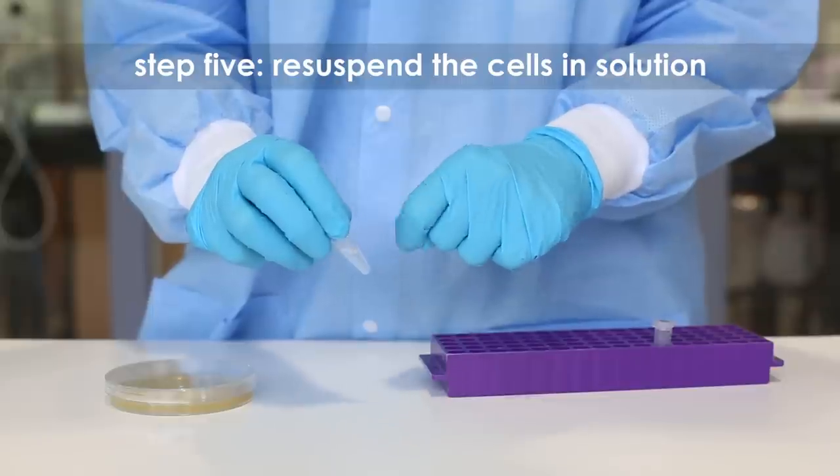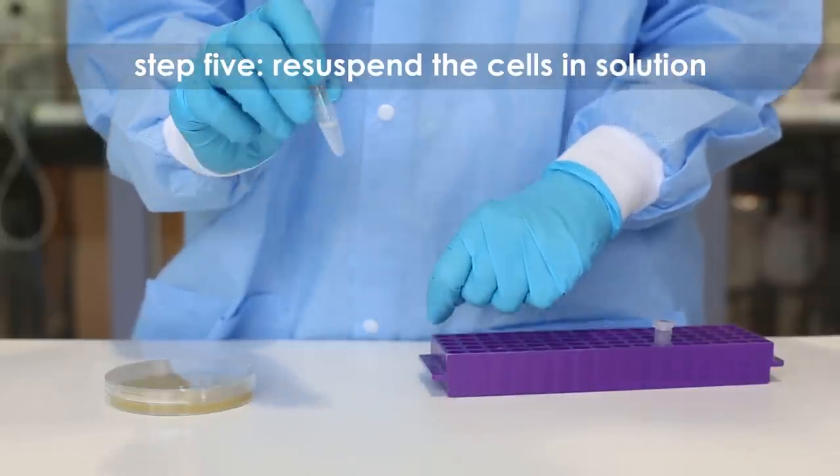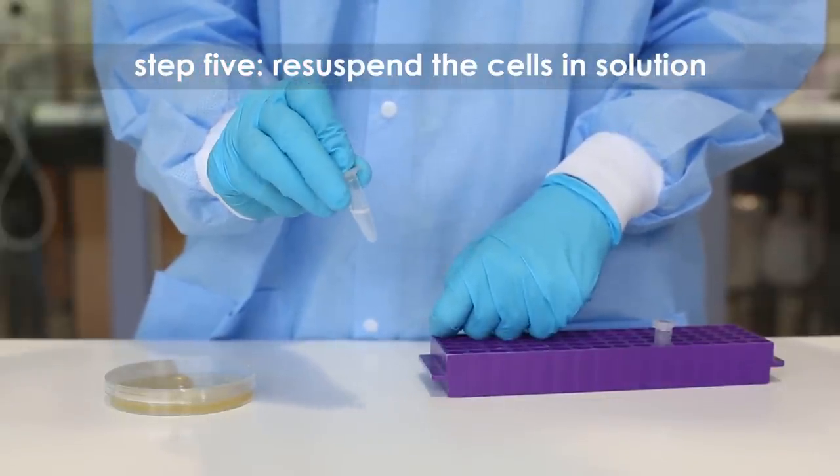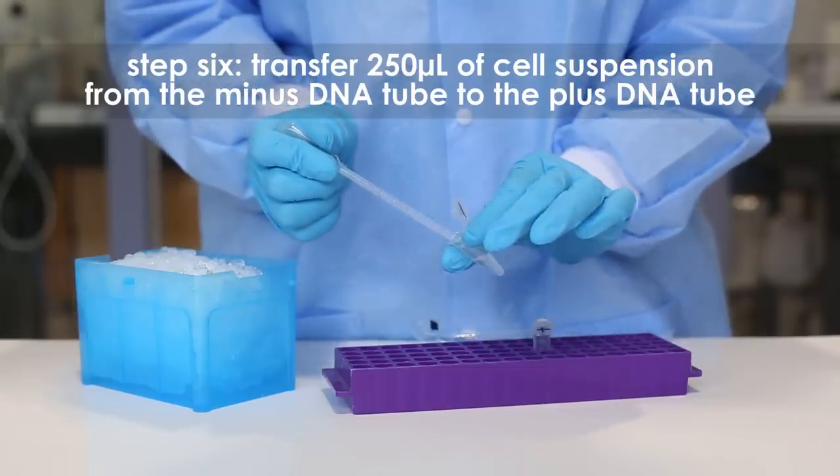Step five: fully resuspend the bacterial cells in the calcium chloride solution until no clumps of cells are visible. The cell suspension should look cloudy.